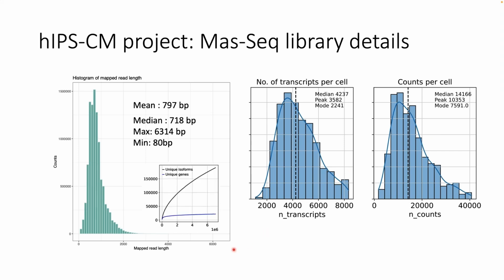Now, how many different individual genes do we identify with that? So we are getting close to about 18,000. This would be the blue curve here at the bottom. And we get many of the isoforms, but they are typically also variations on individual gene loci. So the transcriptome assembly there is something that we were studying then in detail.